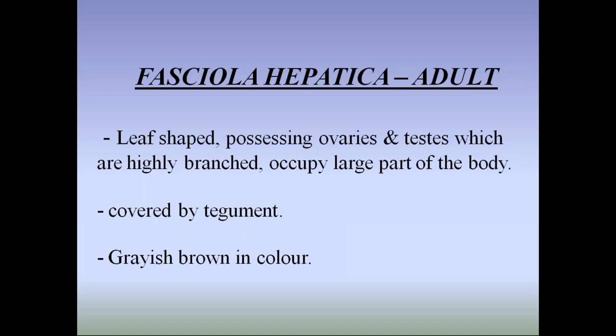The disease is called fasciolasis. Not only in humans, sometimes sheep and other domestic animals are also infected. What is the habitat of Fasciola hepatica? The parasite lives in the hepatica, meaning the liver and bile ducts. The adult worm lives in the liver and the bile duct.